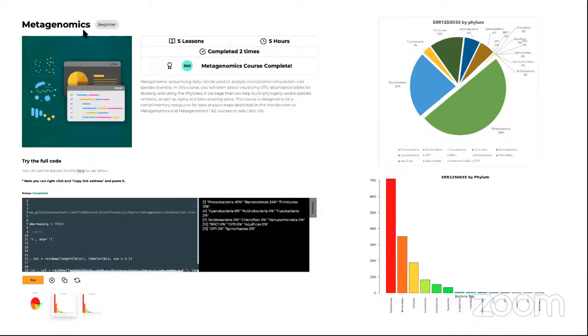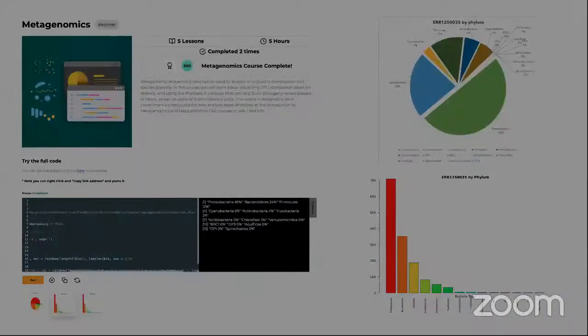So in this course, you will find how to generate an understanding of what types of bacteria are present in a sample by proportion or by abundance, and what are some of the typical considerations around leveraging the different outputs from the pipelines that we already tried, so that your understanding of the composition is also considering the abundance of input data that you have and the sequencing depth that you are using in maybe a different set of samples that you're using overall. So in this course, you will find different practical tutorials.